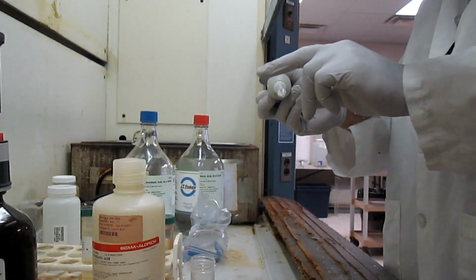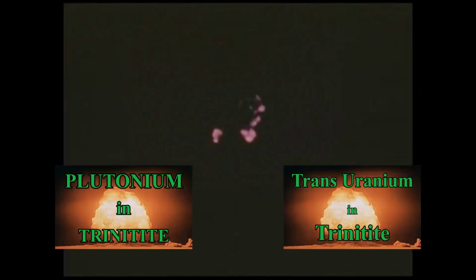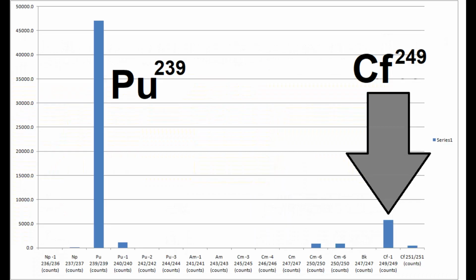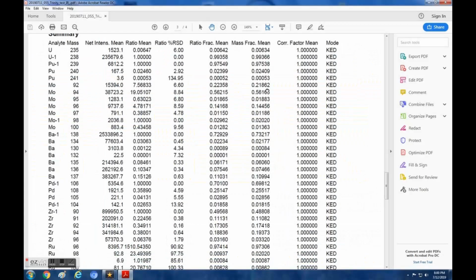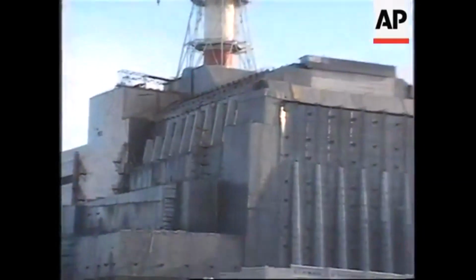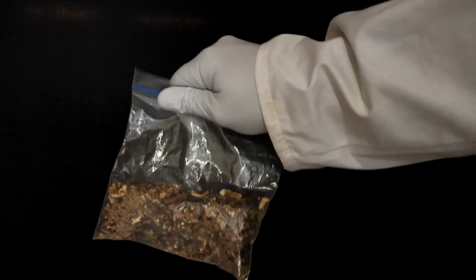I explored the first one, analyzing trinitite from the 1945 Trinity test. In these two videos, I was able to detect a significant amount of plutonium, some upper actinides, and some non-natural isotopic ratio. So in this video, I'll explore the almost 40-year-old Chernobyl disaster using these mushrooms.